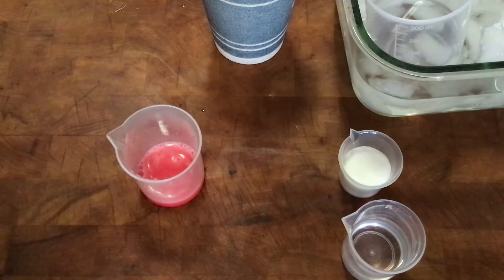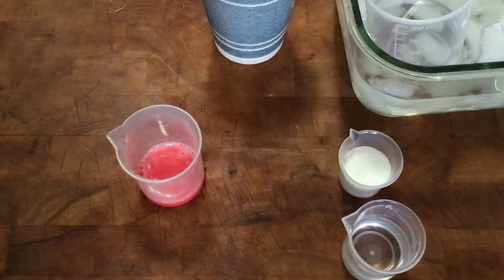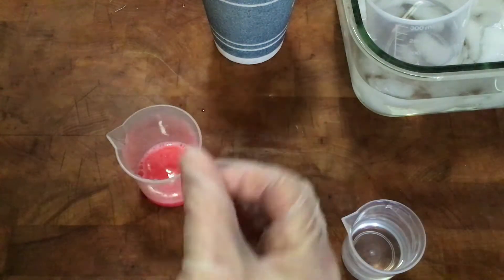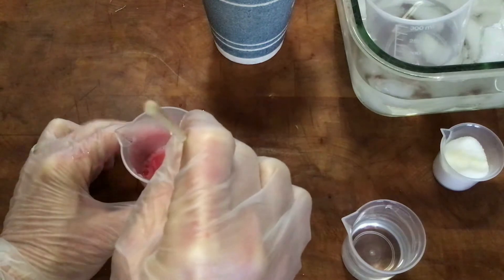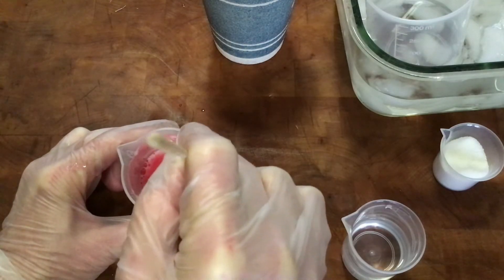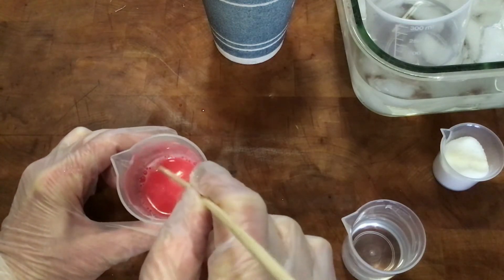Now we have genetic material floating around outside of the cell walls, just in the solution. We have to be careful because we don't want to break up those long strands of DNA, since we want to be able to spool them. I'm going to take some meat tenderizer — just a pinch — and add that, then very carefully stir. We're adding the meat tenderizer because it gets some of the proteins off the DNA, but we do want to stir carefully because if you stir really aggressively it will break up those long strands.